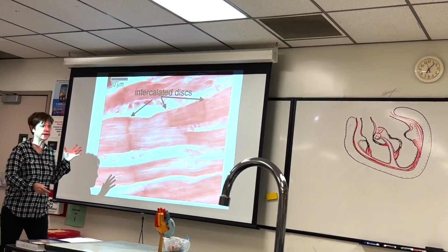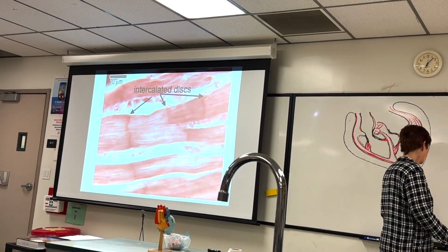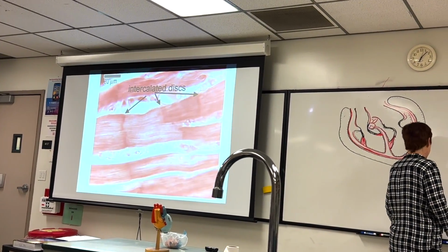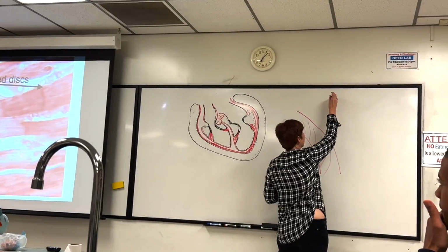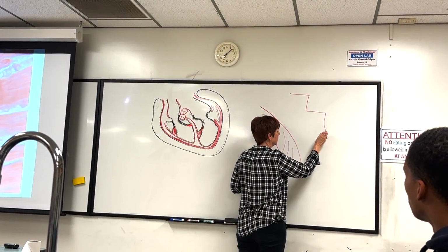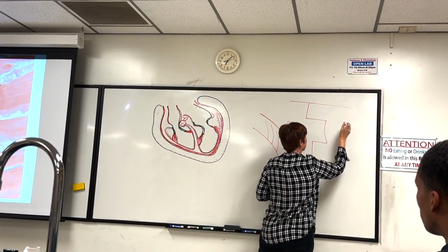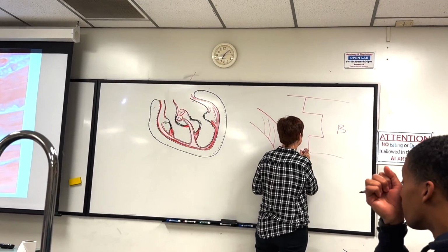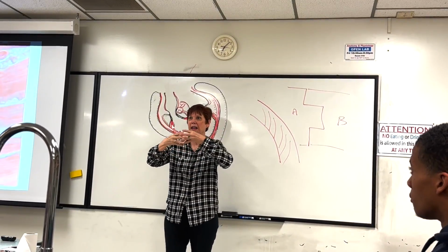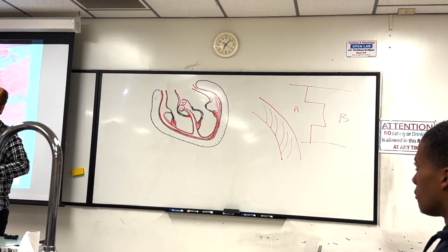And the reason they stand out dark like that, we don't always see plasma membranes really well together, is because this is why we call them intercalated. This would be muscle A and muscle B. So components of two muscle cells would intercalate for their cell junctions.